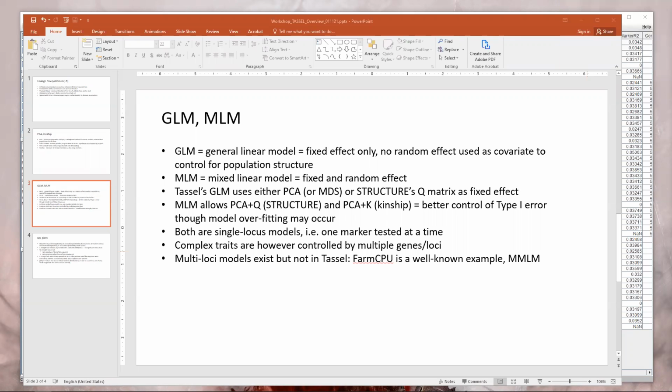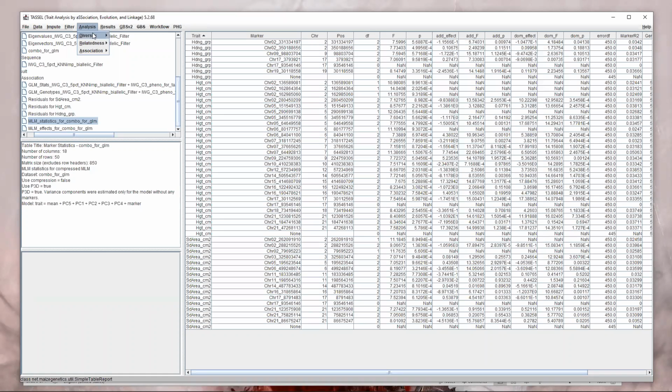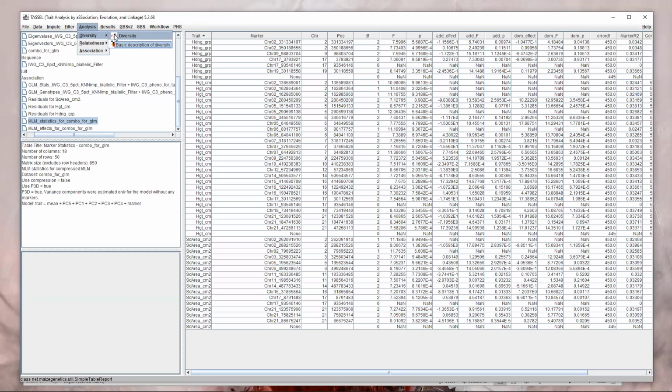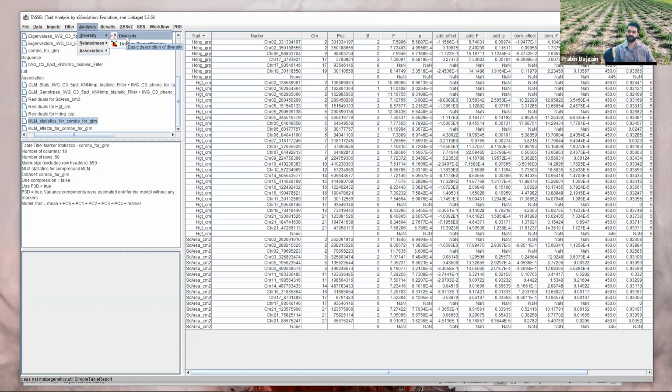I have a question. Mm-hmm. Have you used TASSEL for this diversity analysis function? Oh, not TASSEL. I think I've used VCFtools because I calculated pi using that program. The numbers have to be the same, I think, but I'm not sure. I'm not in TASSEL though.